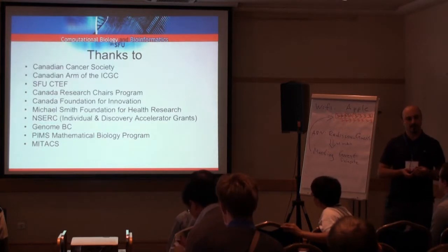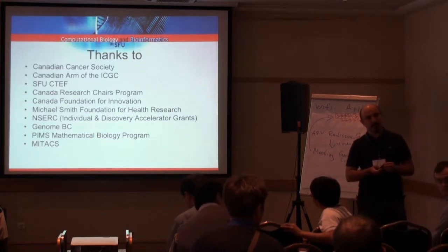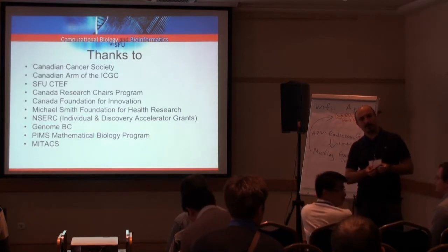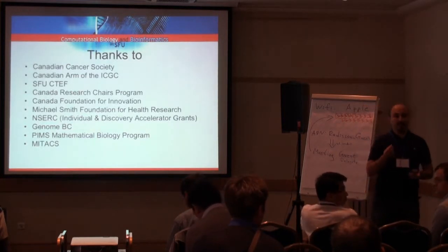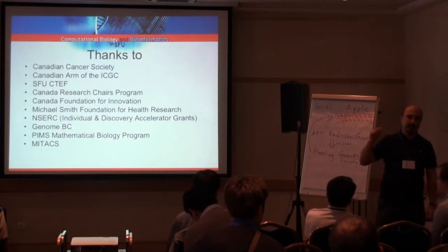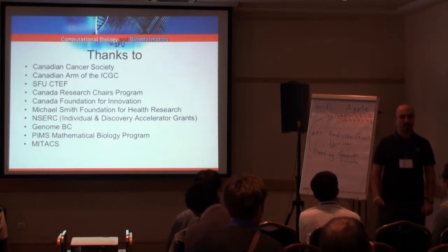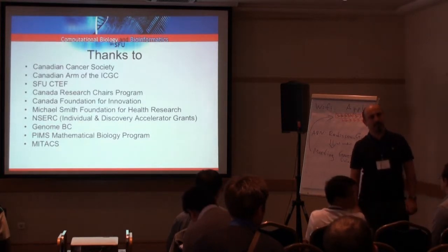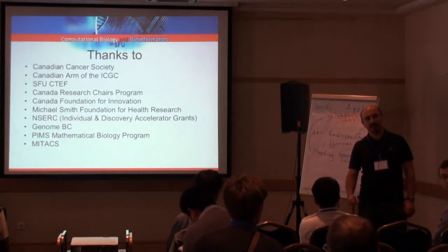But as soon as the genomes are known, then the copy variation is not a problem. What do you mean? Why shouldn't it be a problem? So if my goal is to identify novel inserts, I can do it through mapping anyway. I'm asking about the assumptions when we compare complete genomes. Right? So I don't understand the question.